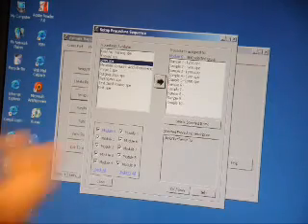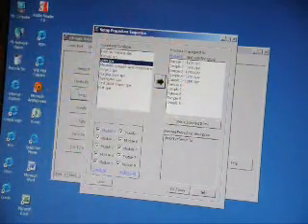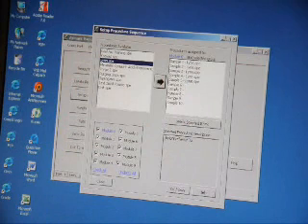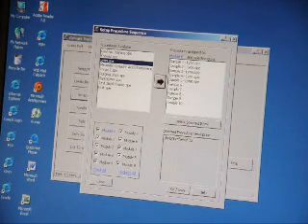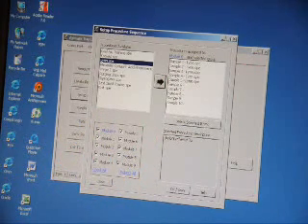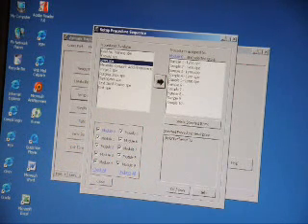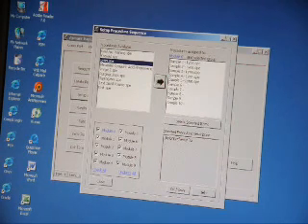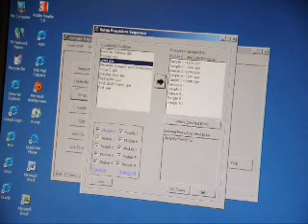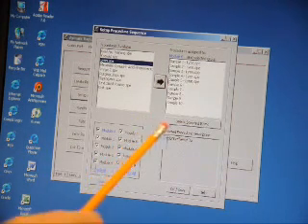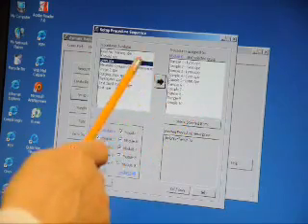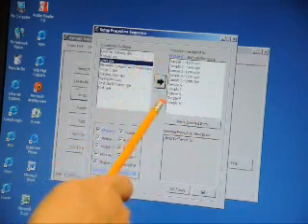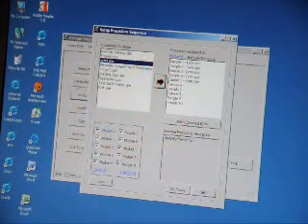If I chose, I could then take another method and I could run it for additional samples. Some of the real power in using this system and in methods development is if you have multiple modules installed, I could selectively be running different methods for different modules and different samples. Or I could simply be running the same method on all 100 samples if I had 10 modules. So right now, I've set up my module to run the method Lynn.spe for samples one through five.